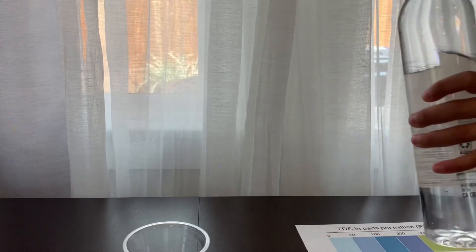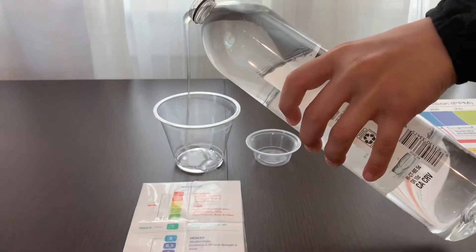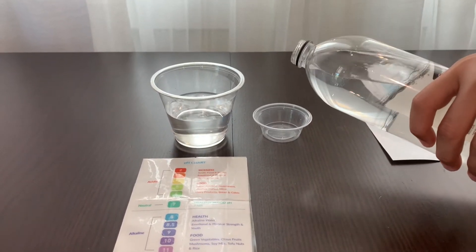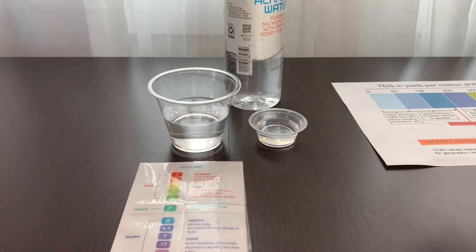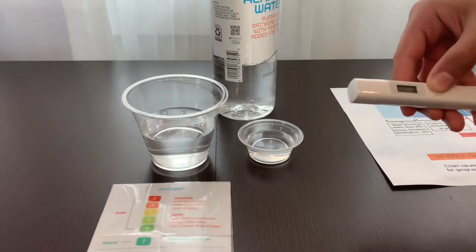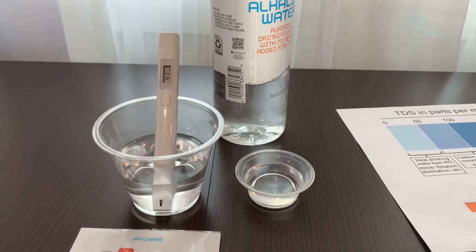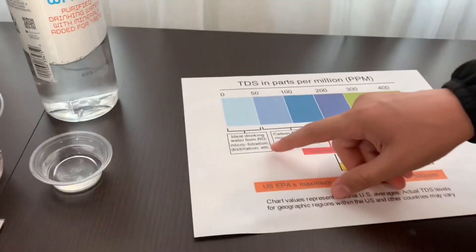Let's pour some water in. First, let's test the TDS level. Turn on the TDS tester, make sure it says 0, and put it in. 41 — that is micro-filtered water.